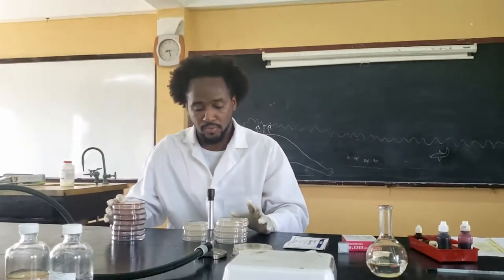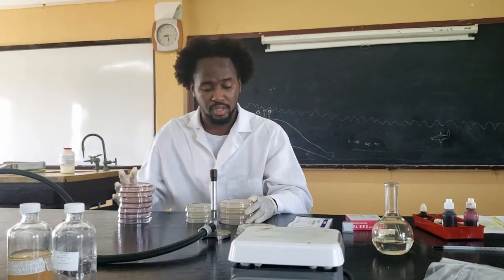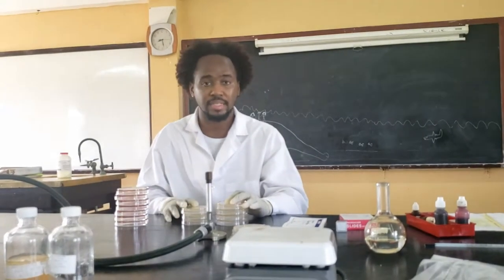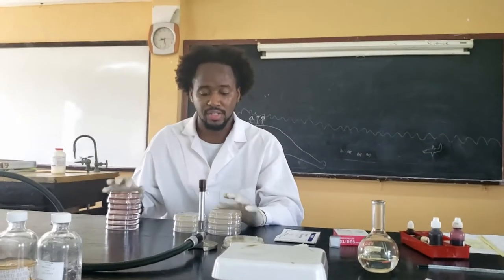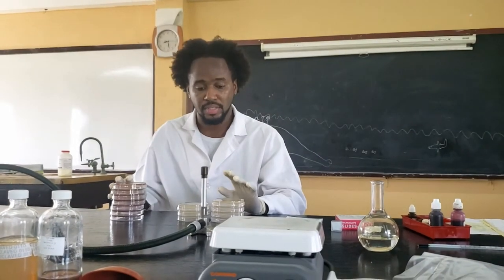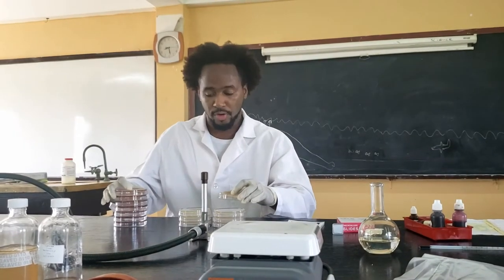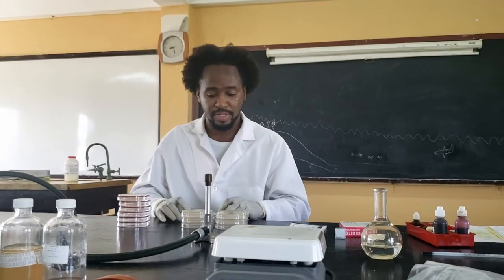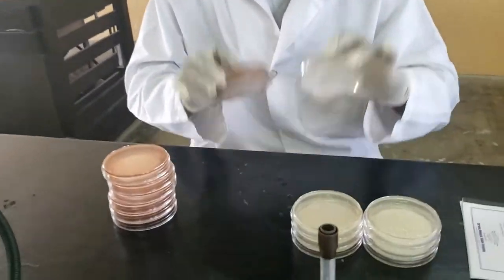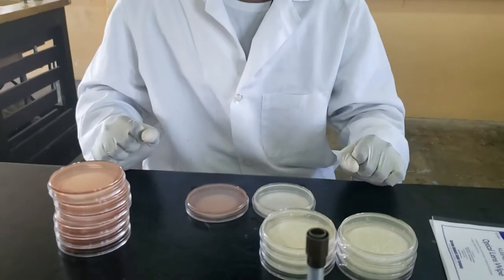So today is just for us to prepare these plates. These will go in the incubator, and after 24 hours we'll come back, observe the plates, and you can then try to identify the types of bacteria that we've grown based on various properties that the lab will explain to you later on. So the first procedure asks us to open the plates, so we'll be working simultaneously with the two types of agar. Notice I'm holding the plates upside down, that's how we normally store them.